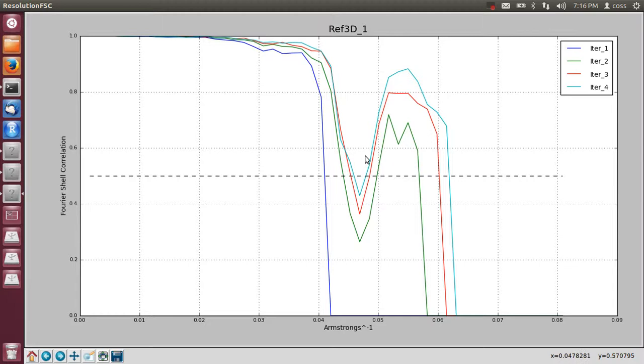Normally this is done in a standard data set because you have a range of foci, so not all the micrographs have the same zeros. So the Fourier shell correlation was increasing, except for this area where we don't have any information. Okay, so this went well.